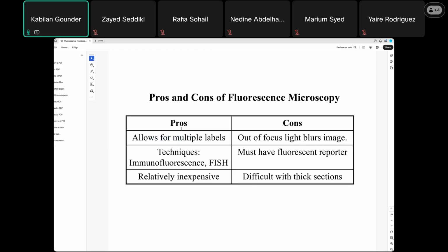So, pros and cons of fluorescence microscopy. So far we discussed many advantages, and the techniques that help to understand the basics, and also understanding the chromosomal abnormalities, genetic abnormalities, and you can detect cellular events, and you can use it to see the expression of proteins, polysaccharides, lipids, and everything, apart from the cell structures.